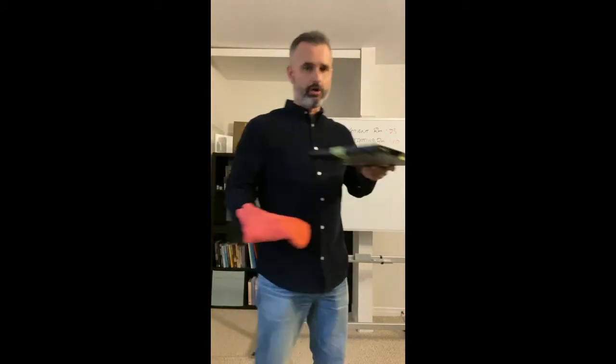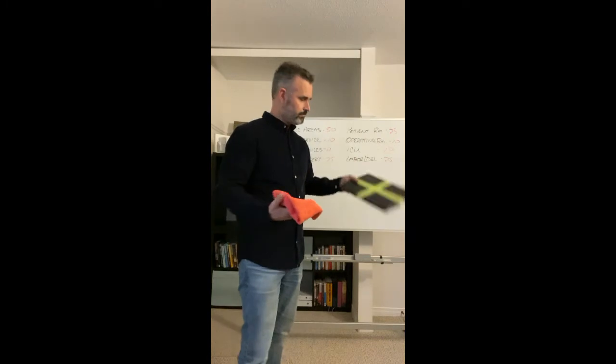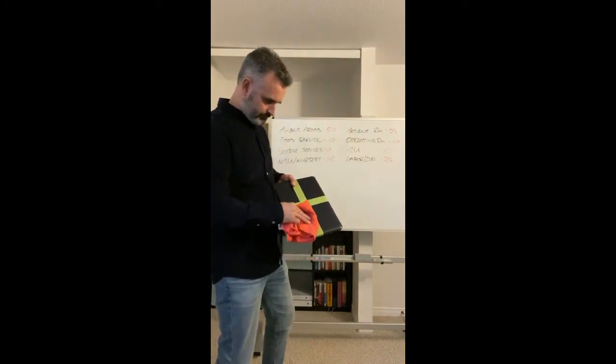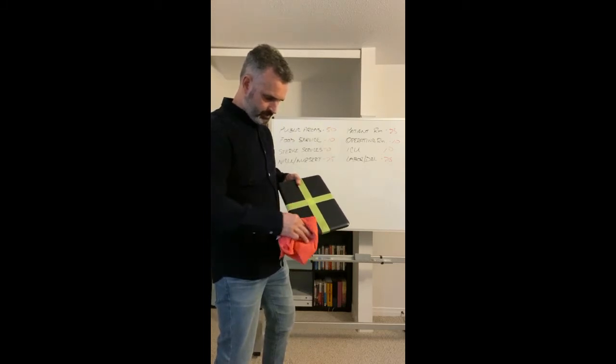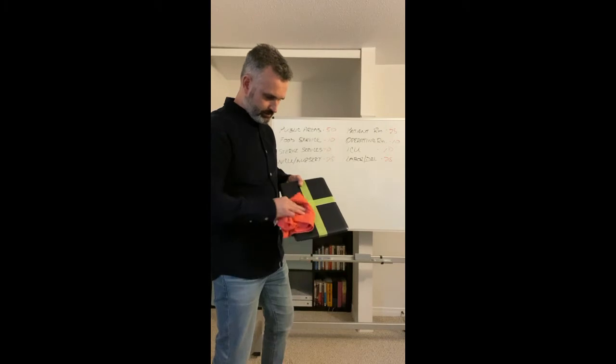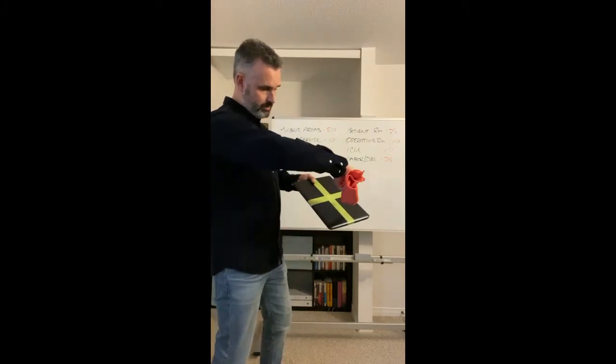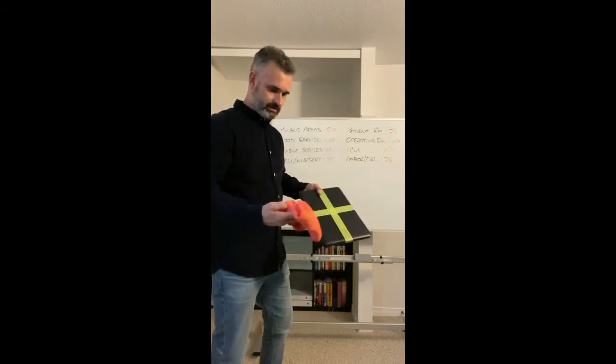And when we're doing a proper cleaning, we'll take this for example. So let's call this 4 surfaces. So if I'm cleaning here, this is going to be our clean only section. Okay, so I'm going to go up to our sanitize section.